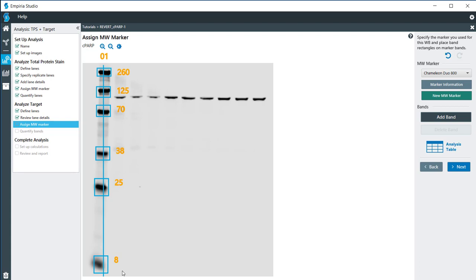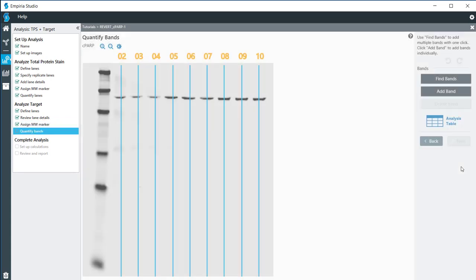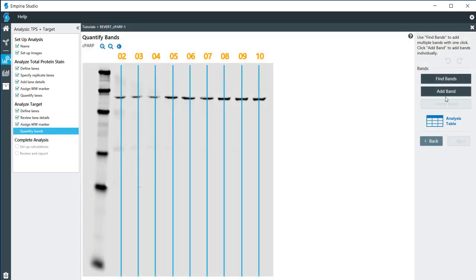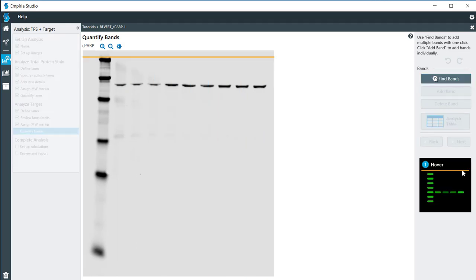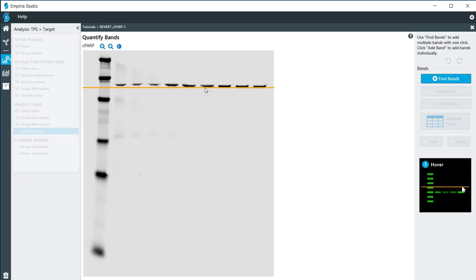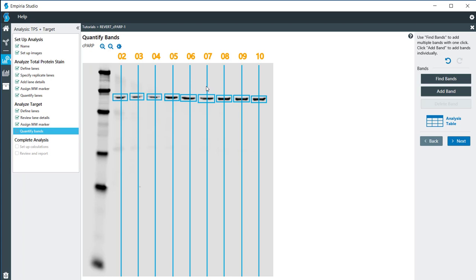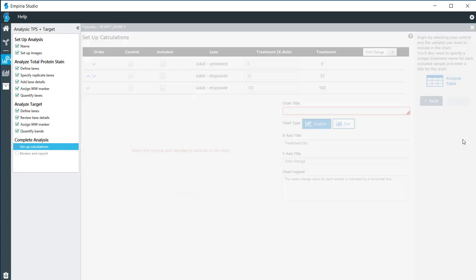Once that is all set properly, go ahead and click on Next. For my target, I can either click the Add Bands or the Find Bands. The Add Band just gives you one by one. With the Find Bands, I can move this line into the approximate location of my target and click. Then if need be, I can edit the size and location of these as needed. Everything looks okay with that, so I'm going to go ahead and click on Next.